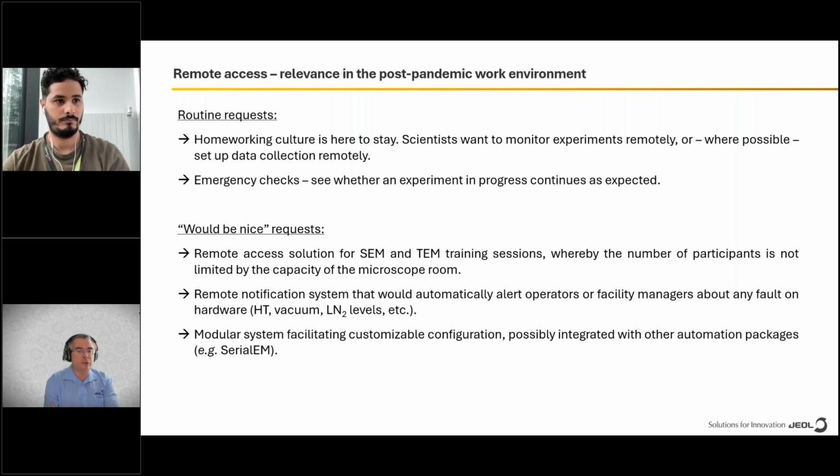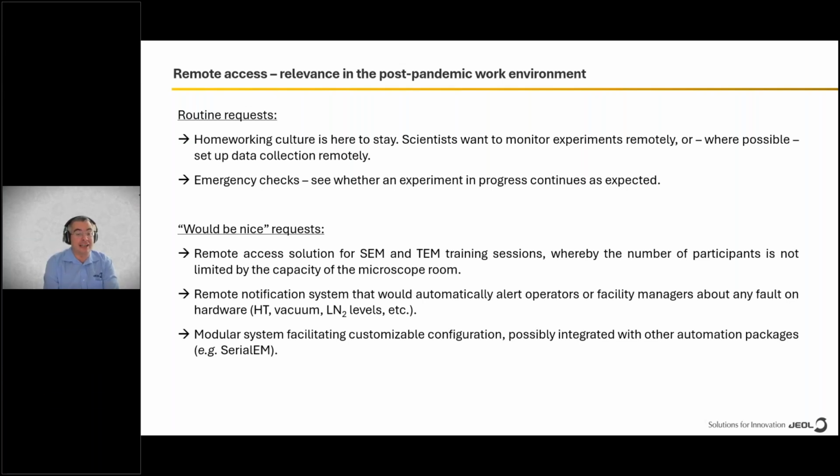However, there was no way to spend time at the facility. So the facility manager loaded the sample onto the microscope during his 1 hour of exercise that was allowed to the UK population at that time. Basically, people were able to get out of home just for 1 hour a day to exercise. Some of us like to run, other people prefer to swap samples at TEMs. That's how that was done.